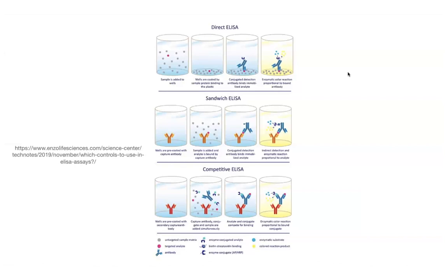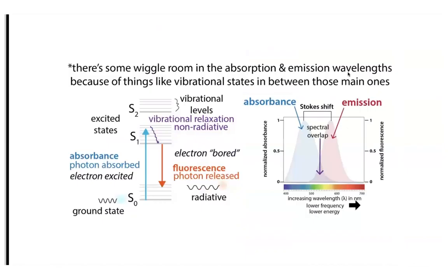It might not be. So you need to be really, really careful and have good controls so that you can subtract out the background. There are also benefits of Western blots over ELISA in things like seeing the different sizes, which can tell you if there are different forms of your protein, and things like that. So lots of cool things about Western blots and co-IPs and stuff that you couldn't get from an ELISA. But an ELISA does have benefits, such as being able to test patient samples and things like this.